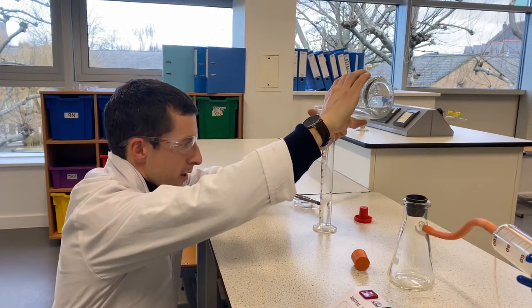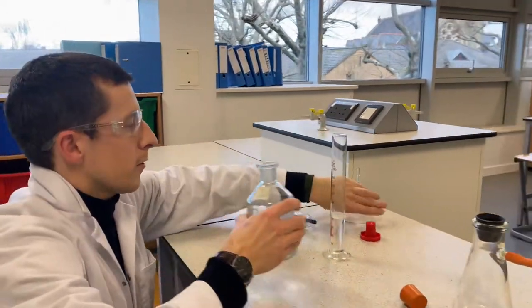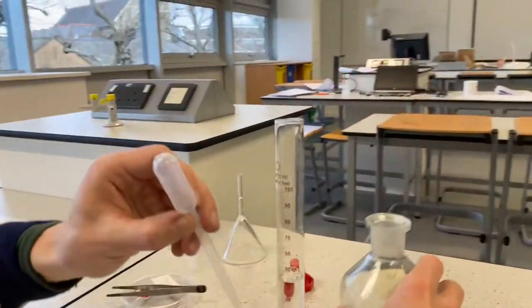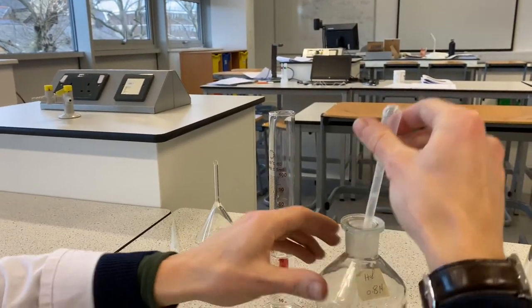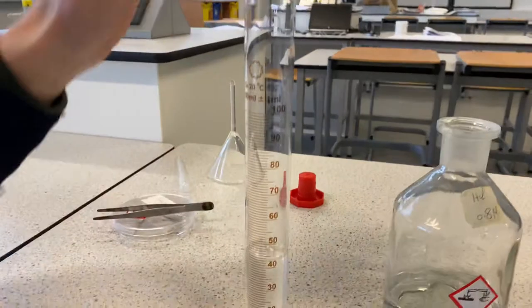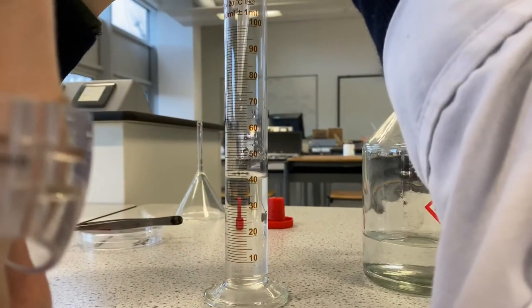I'm going to stop there and switch to use a dropping pipette instead, because I want to be quite accurate with my measurement. So I'm going to place that in and bring this quite close, get down to eye level, and then get my eyes in line with 50.